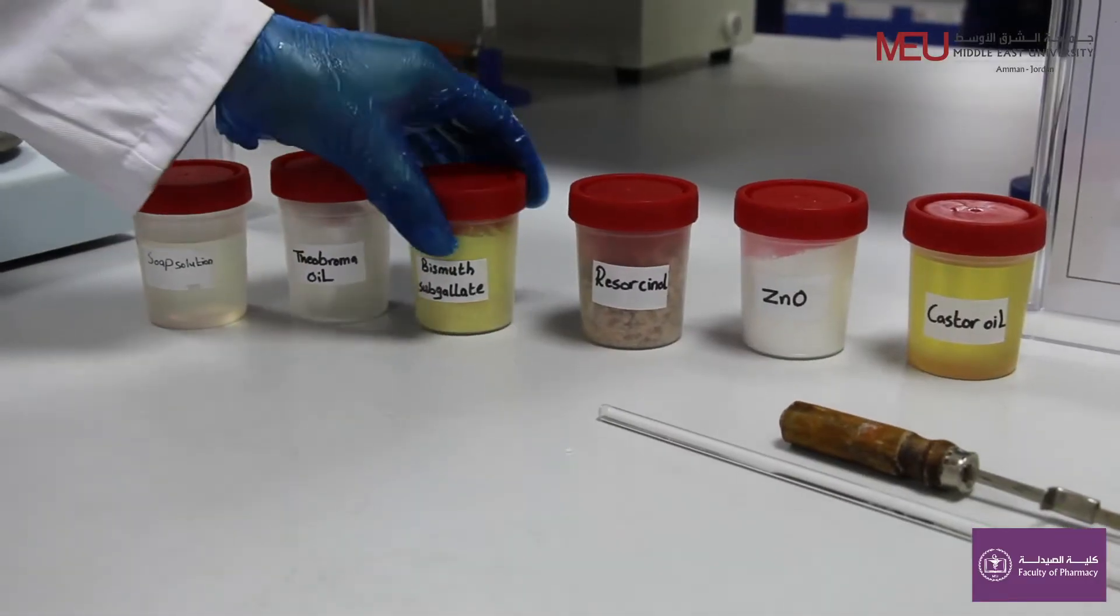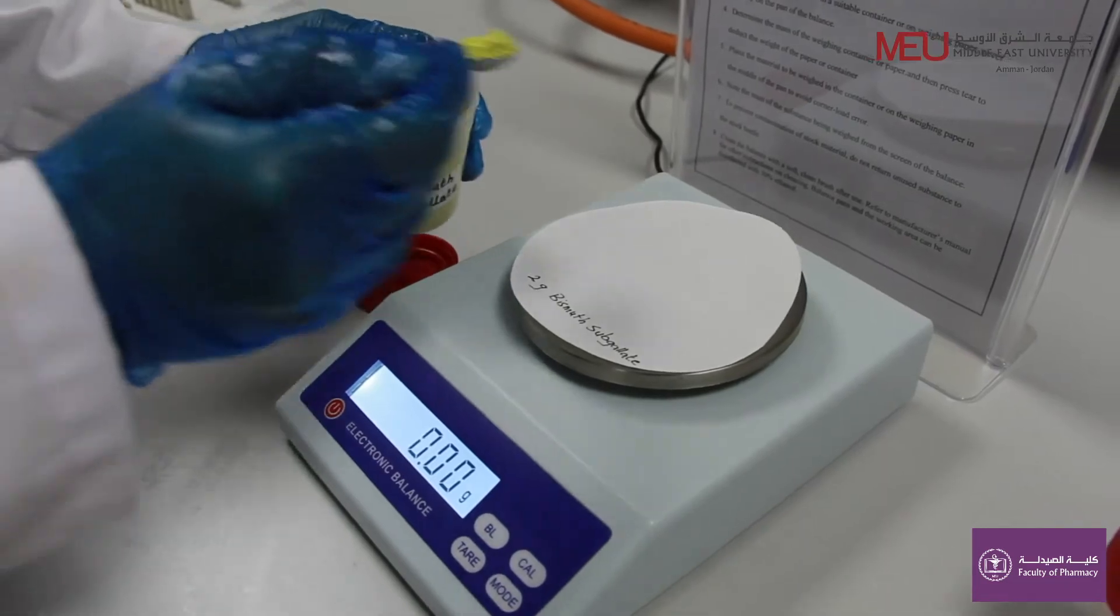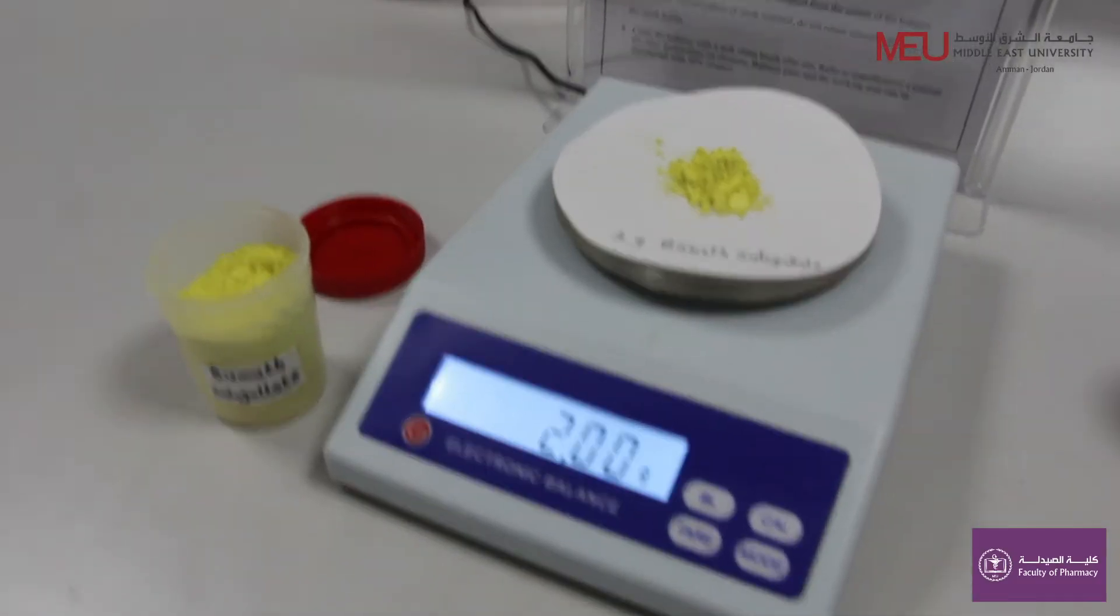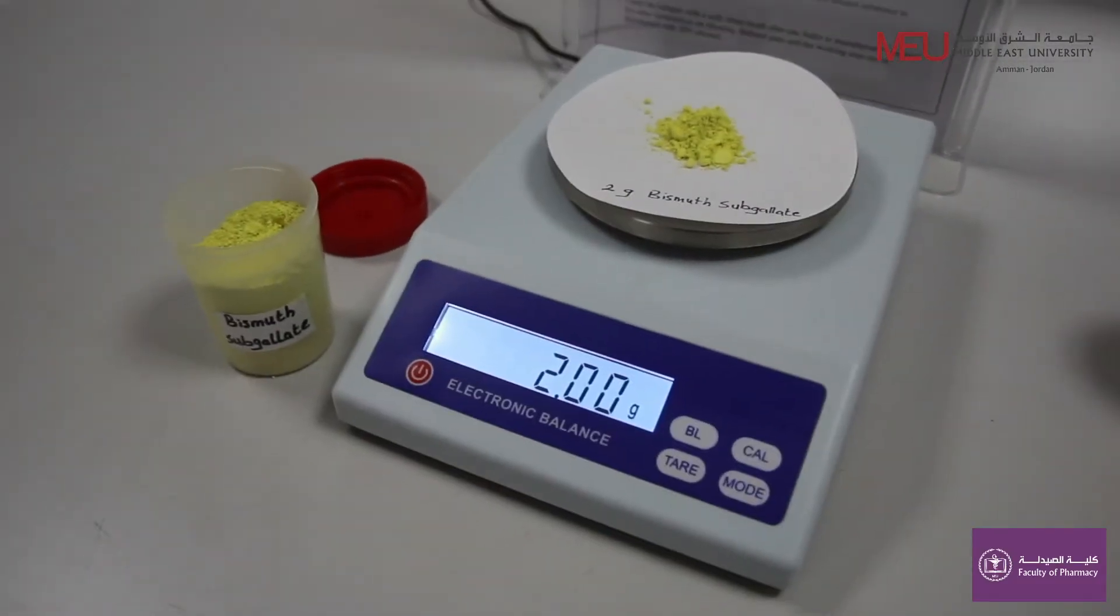Weigh 2 grams of bismuth subgallate. Here, bismuth subgallate is used as an astringent to treat the hemorrhoids.